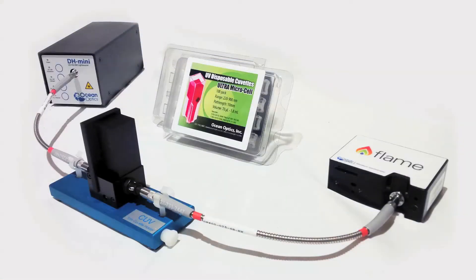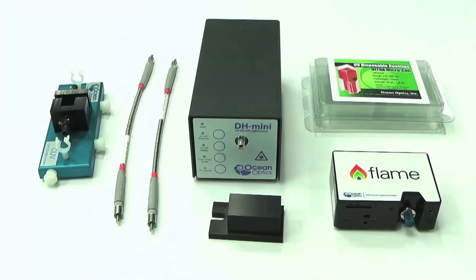In this video we will demonstrate how OceanOptics products can be used to perform a basic absorbance measurement. We will use products available as an absorbance bundle or as separate products.